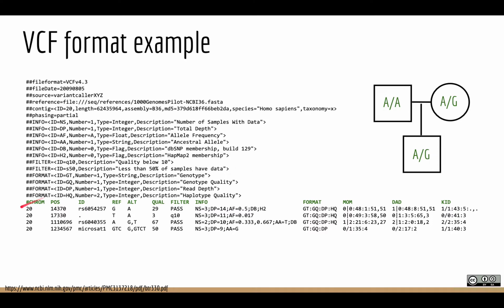So what I'm reporting is 4 different sites. This is just a snippet of a VCF file. There should be like 6 million sites in the full VCF. 4 different sites where the reference allele is reported and the alternate allele. What you see here is a mixture of genotypes, some of them have a pipe symbol and some of them have a slash symbol.